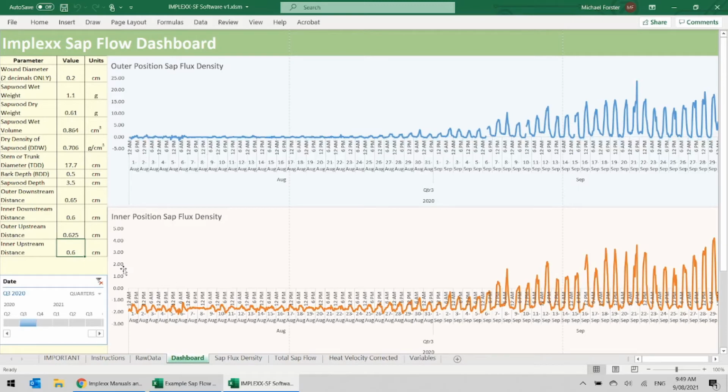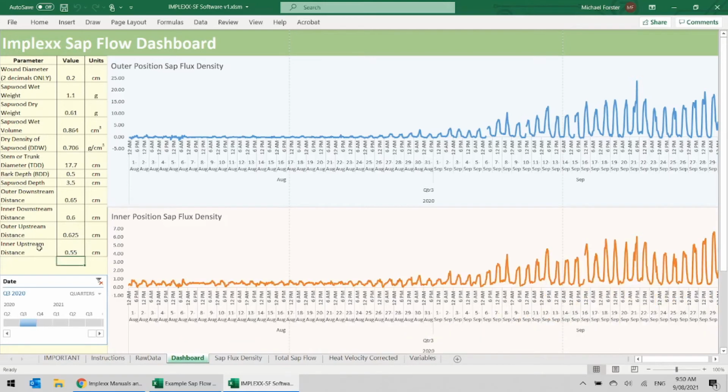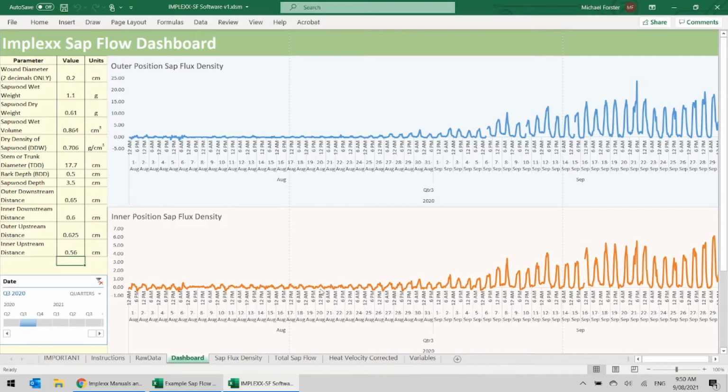And let's do the bottom data set. So let's go for a higher number here. Let's see how that, and that's actually made it more negative there. So that's not quite correct. So let's go the other way. Let's go a number below 0.65. And you can see here it's now above zero. So that's not quite correct either. So let's just adjust that slightly. And there we go. We can see there that it's now sitting on zero.